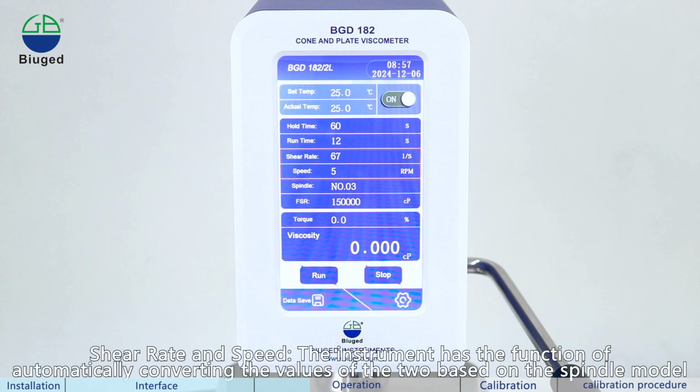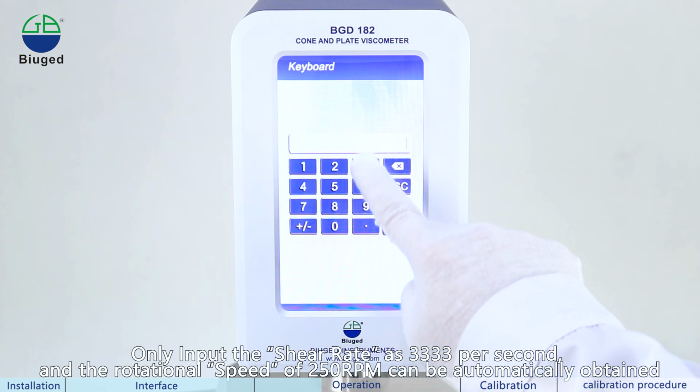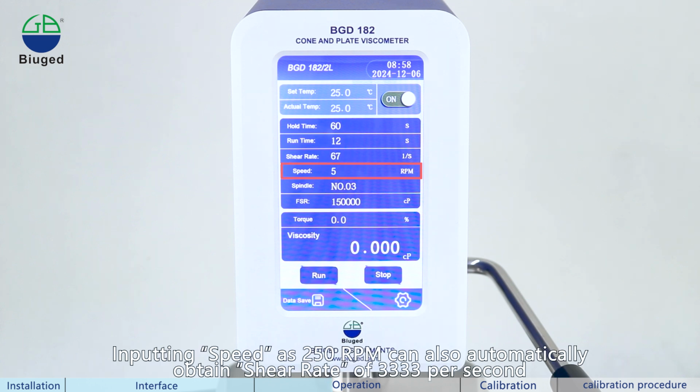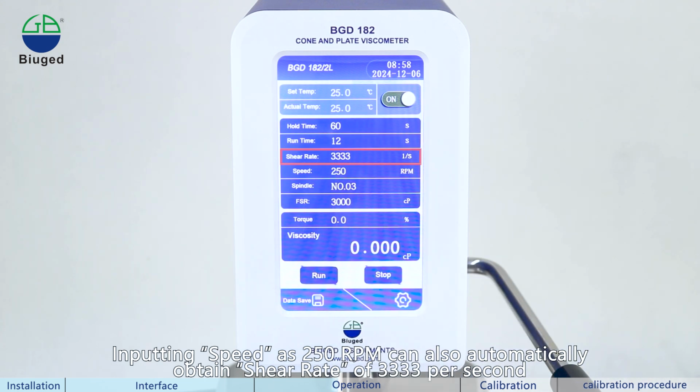shear rate and speed. The instrument has the function of automatically converting the values of the two based on the spindle model. Only input the shear rate as 3,333 per second, and the rotational speed of 250 rpm can be automatically obtained. Input speed as 250 rpm can also automatically obtain the shear rate of 3,333 per second.